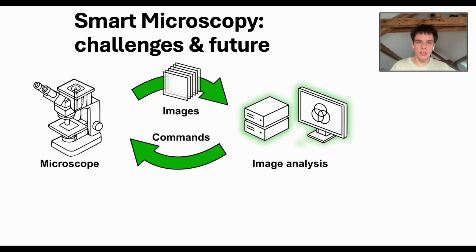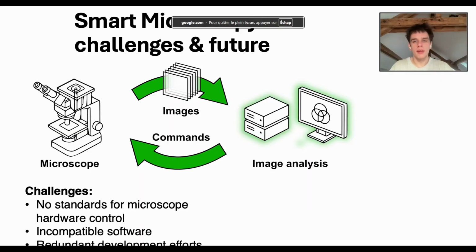Some of the challenges I ran into is that there's really no standard for hardware microscope control. So whenever you want to transport one workflow to another microscope, you have to basically reprogram it. Even taking it from one Nikon microscope to another microscope within the lab, that just had a bunch of different drivers and different attachments, took me like 3 months to adjust. So I don't want to imagine how long it will take to take it to a completely different system. Which leads to a lot of incompatible software and also a lot of redundant development efforts across different labs.